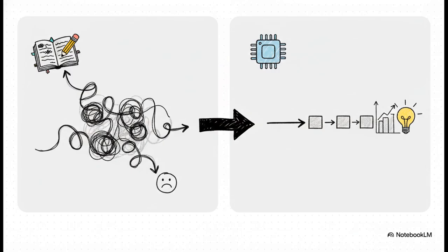See, your data sheet isn't a diary for you. It's a structured input for a computer. When we set it up like a diary, it's messy, it's manual, it's slow. But when we format it for the machine, we go from wrestling with this tangled mess to getting crystal clear insights in minutes. It's literally the difference between chaos and clarity, between slow and fast.